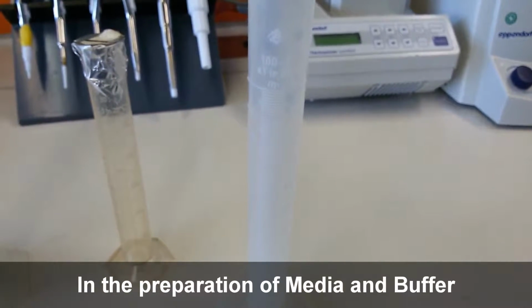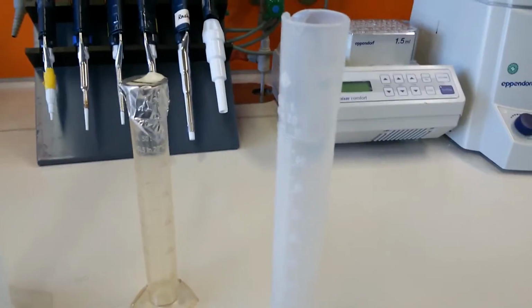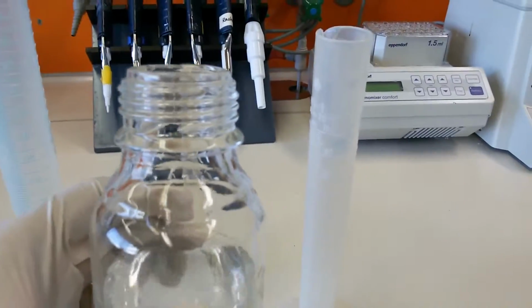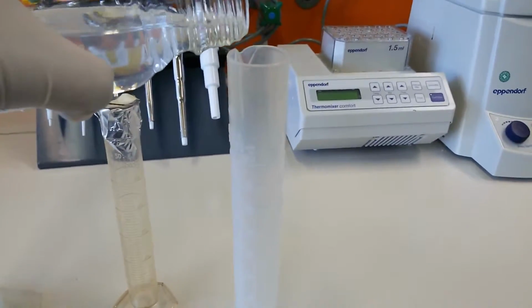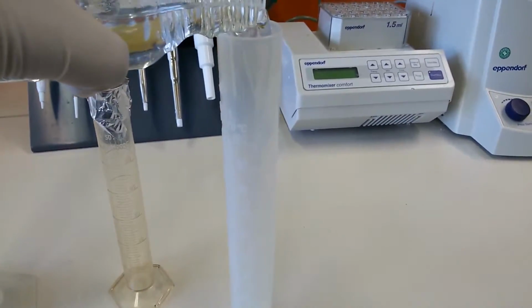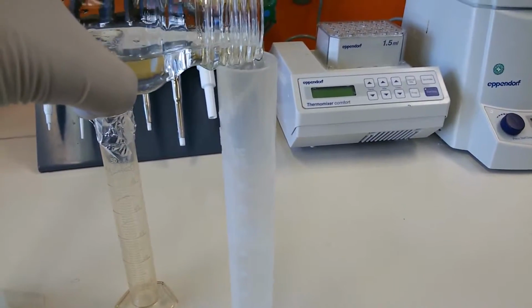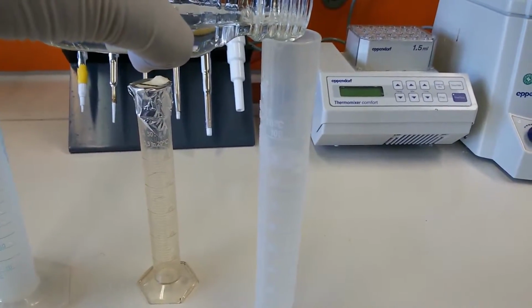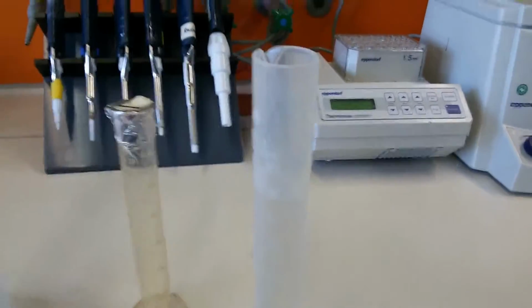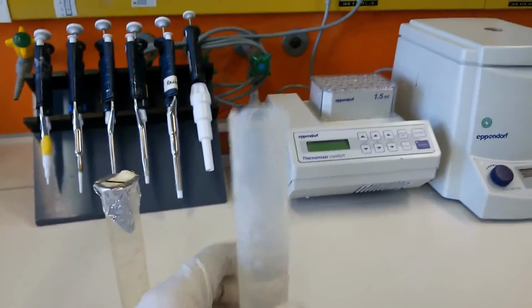We'll take the example of our 100 ml measuring cylinder, and we will measure some volume. Right now I have some water in my hand, and I will show you in a very general way how we measure it. So you can see it here. Now I'm filling it up. Let's say you just want to measure only 90 ml. So you fill it like this. Then you can look at here.